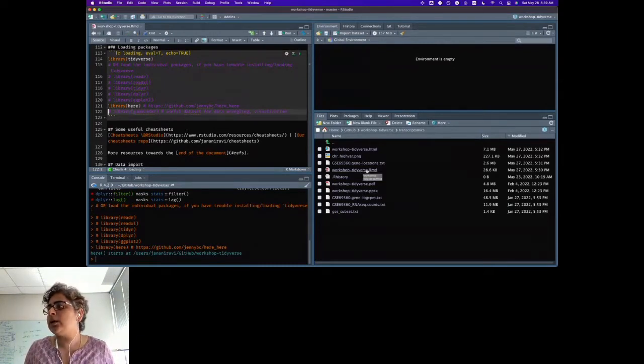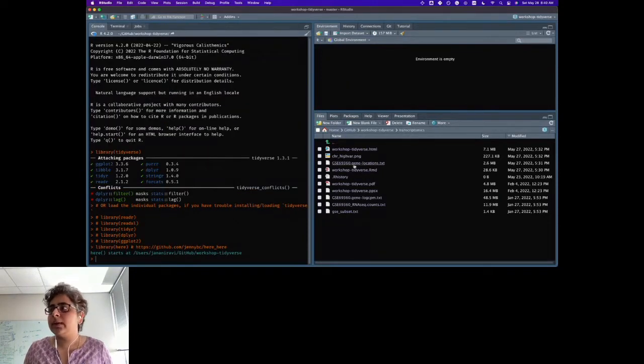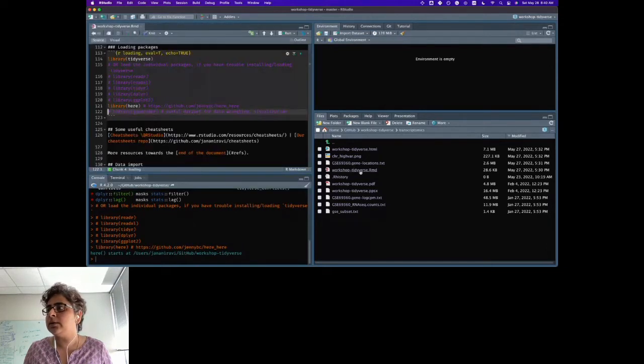How can I see the code instead of just the console? If you click on R Markdown here, so if I close this, you'll only see the console. But if I click on R Markdown here, from my Files tab, in the Transcriptomics folder, then this would open up. Genevieve, you'll have to click on the R Markdown.